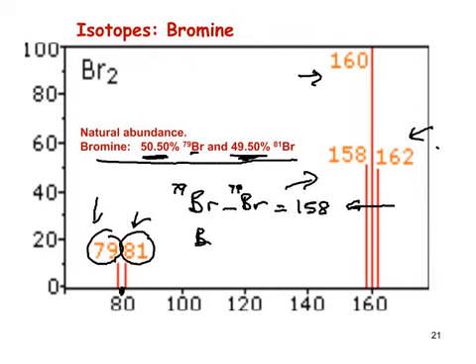You could also, in simple terms, have one that's made up of 79 and 81. But actually, it could have been the other way around, and statistically, you need to consider this as a separate possibility, namely 81 with 79.